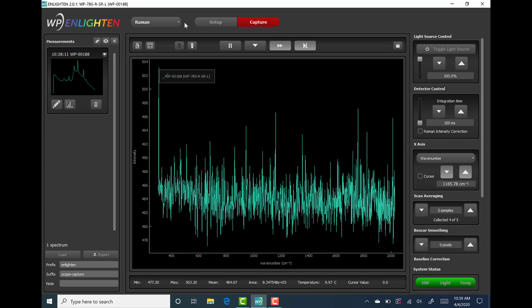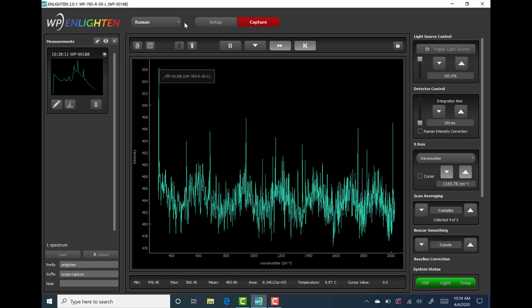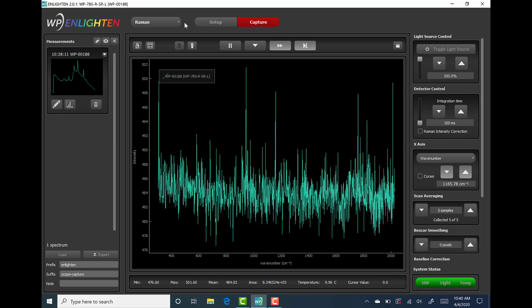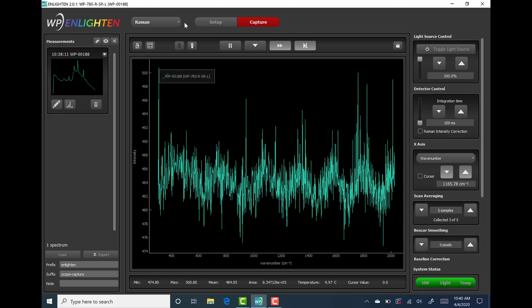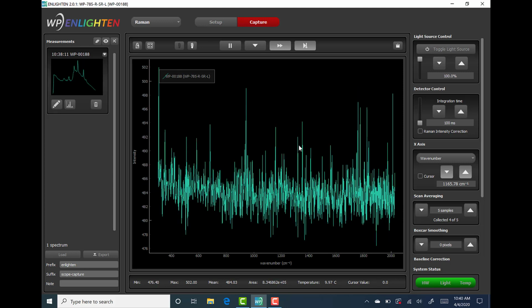Moving forward, in order for the user to collect reflectance and/or transmission measurements, a Wasatch Photonics spectrometer is required. However, the exact model of the spectrometer will depend on the wavelength range of interest. For example, if the sample is expected to reflect or transmit light in the near-infrared range, then the spectrometer's detector will have to accommodate those measurements.